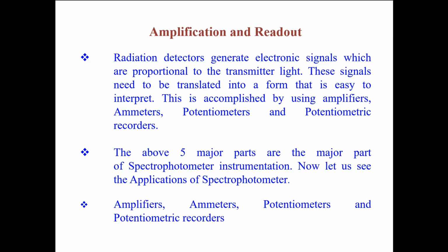Okay, so afterwards, you can also see that there is another wavelength selector that is called diffraction grating. So instead of a prism, the diffraction grating will be there, and the diffraction grating is also an accurate one. So that's why you can see almost all the modern instruments hold the diffraction grating as the monochromator box.